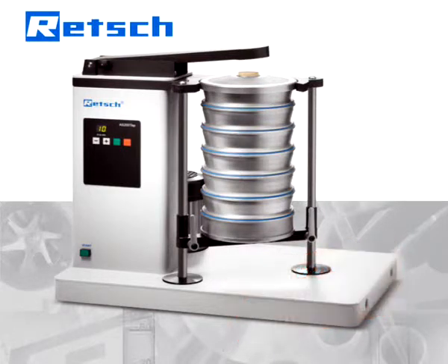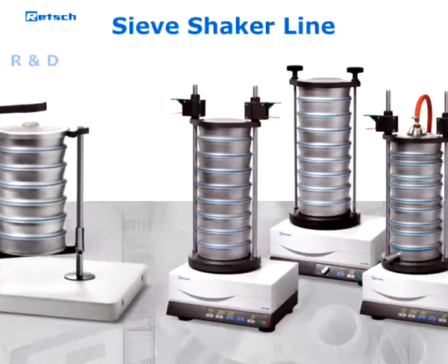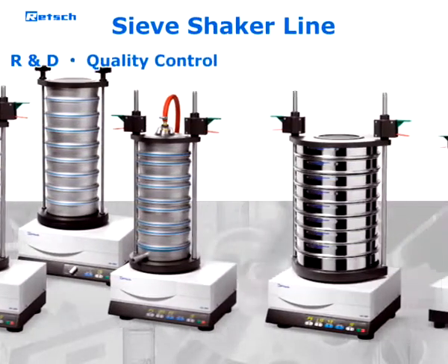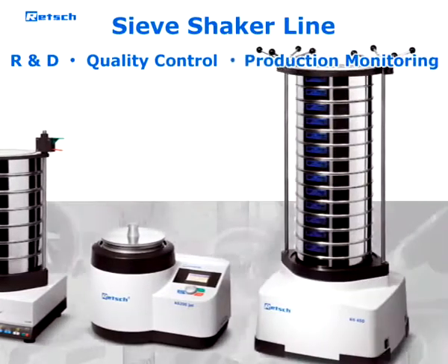The AS200 TAP is part of the Retsch sieve shaker line, which has been used in R&D, quality control of raw materials, intermediate and end products, as well as in production monitoring for many years.